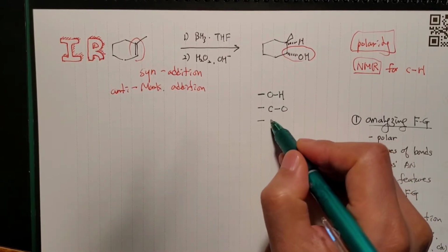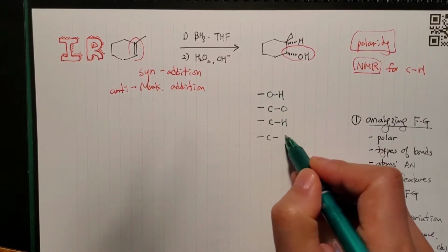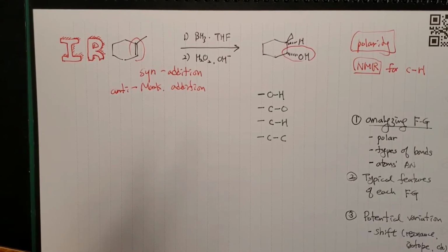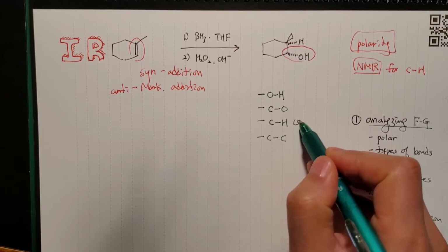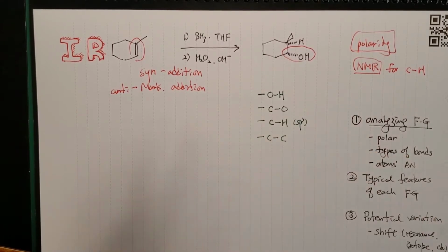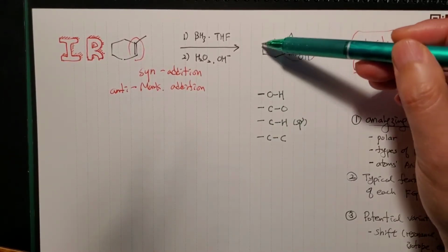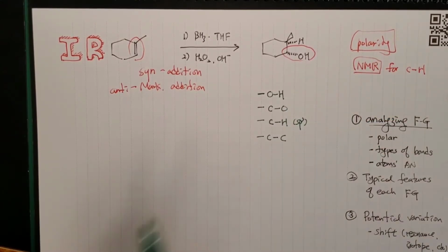So you can see some CHs and some CCs, carbon-carbon bonds, right there. And the variety of CH on the sp3 carbons you see, and some of them are CH3 giving unique signal, and the CH2s also giving unique signals, but we're not getting into that detail for sophomore organic chemistry. So this much of analysis is good enough for product.